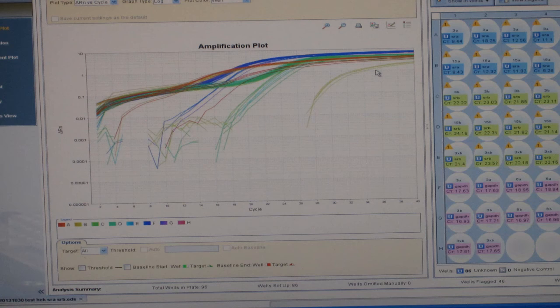In the fifth photo we can see the colour of the different reaction wells being amplified after the cycles. A fluorescent primer is added to each mixture to allow us to track the copies, and each well is represented on the right.